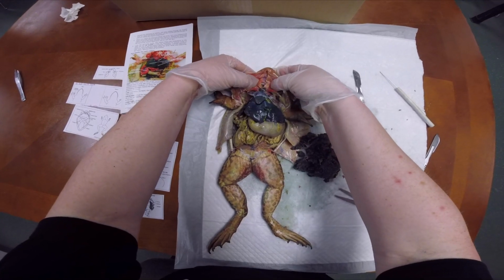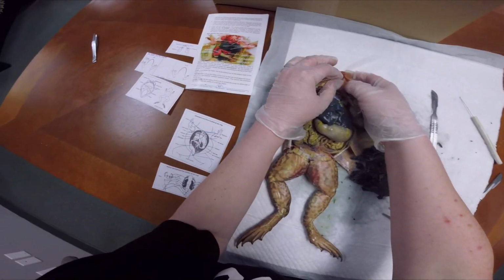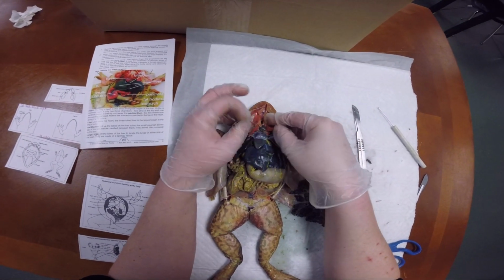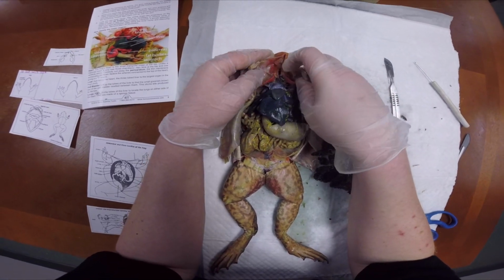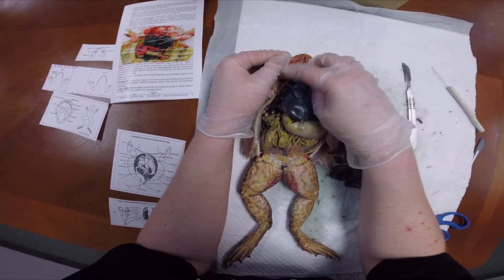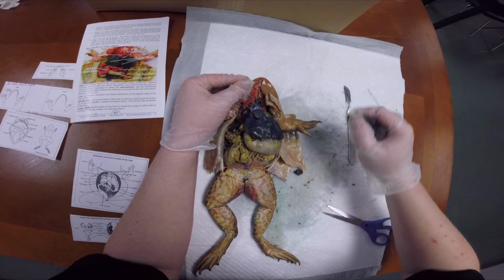That is the esophagus that I kind of accidentally cut through, but that's okay. Then we have several veins up here that you can kind of see from the dye. Makes it a little bit easier for us to tell. You've got arteries.